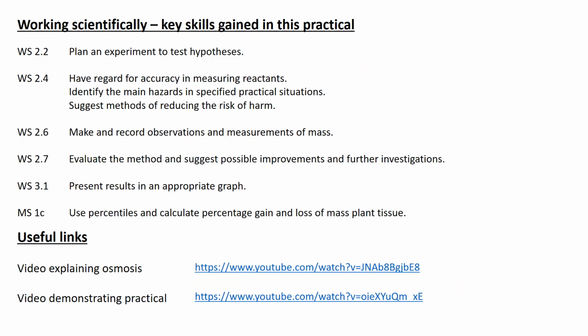So, the skills gained, and they're going to be assessing in this practical. The idea of a hypothesis. We have a regard for accuracy in measuring reactants, okay? And identifying hazards, making and recording results, evaluate the method and suggest possible improvements for further investigation. Present results in appropriate graph. They quite like this one in an exam, guys. They often ask you to use the graph to calculate or to predict the result, a missing result. And use percentiles and calculate percentage gain and loss of mass in plant tissue.